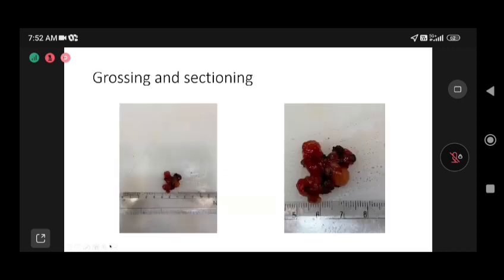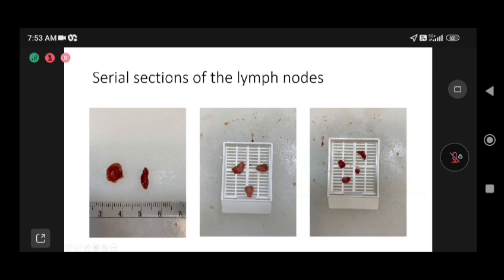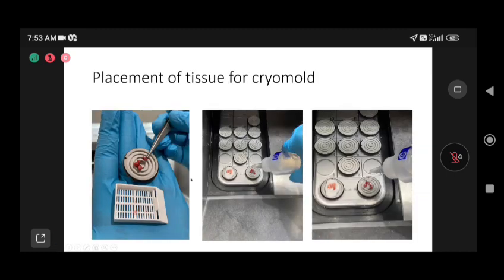Here is an SLNB sample received in the lab. You can see fat tissue with lymph nodes. We palpate and measure, then retrieve the nodes — in this case two nodes — trimming all the fat. The bigger node is serially cut in 2 mm thickness, and the longer node is also sliced at 2 mm thickness so we do not miss any micromets. We cut nine sections from each to ensure no small foci of metastasis are missed for SLNB cases.